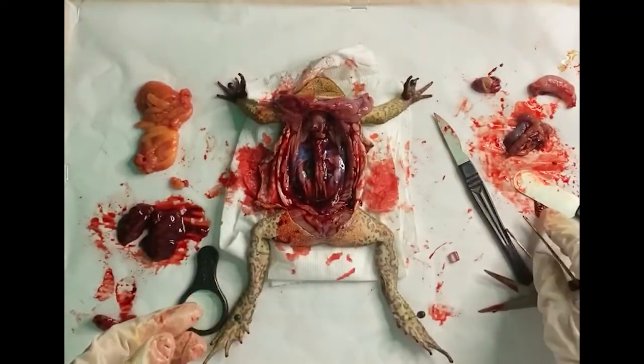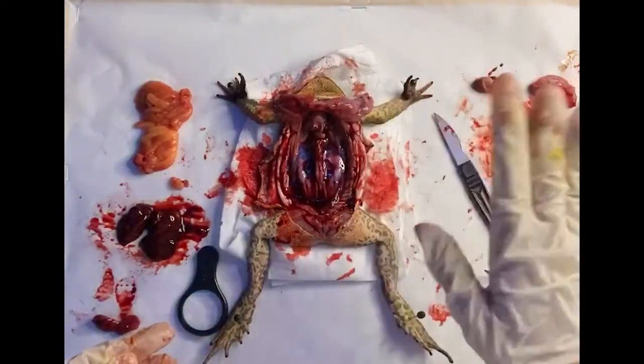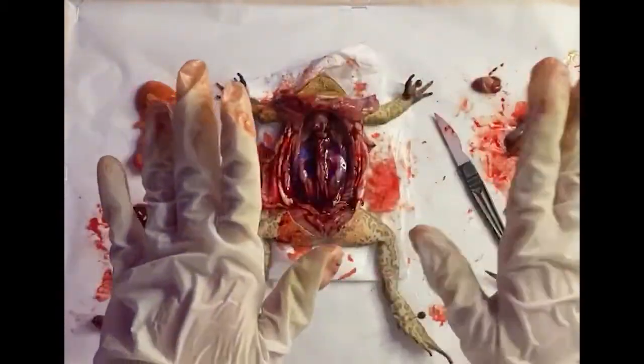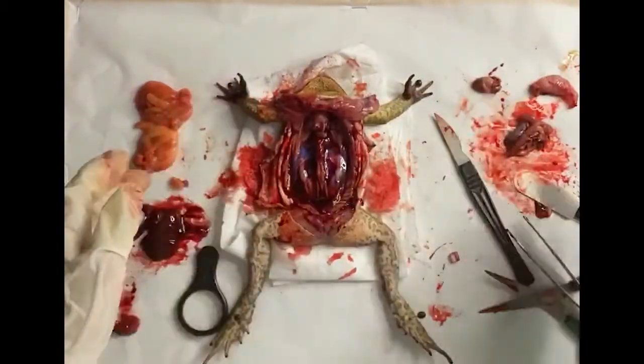So I guess everything's been covered. This concludes our frog dissection activity.